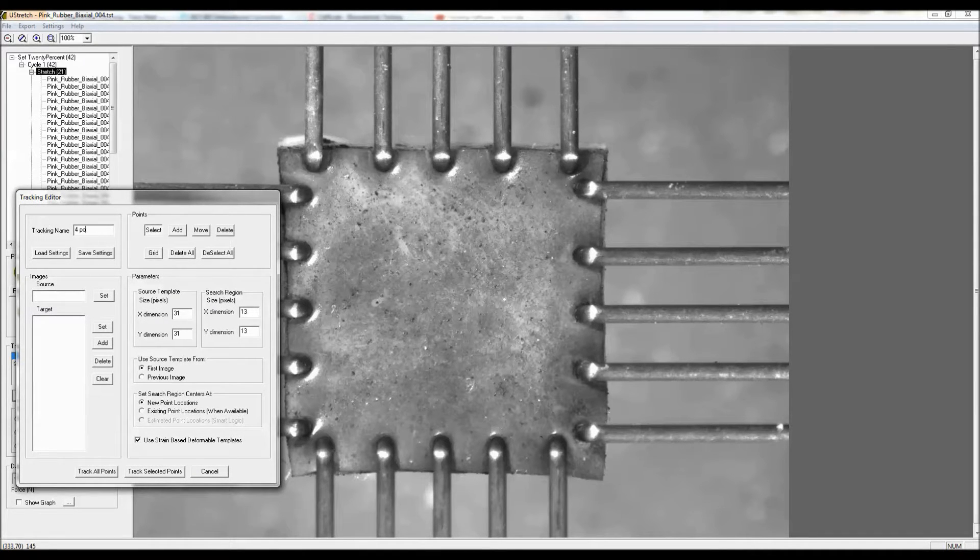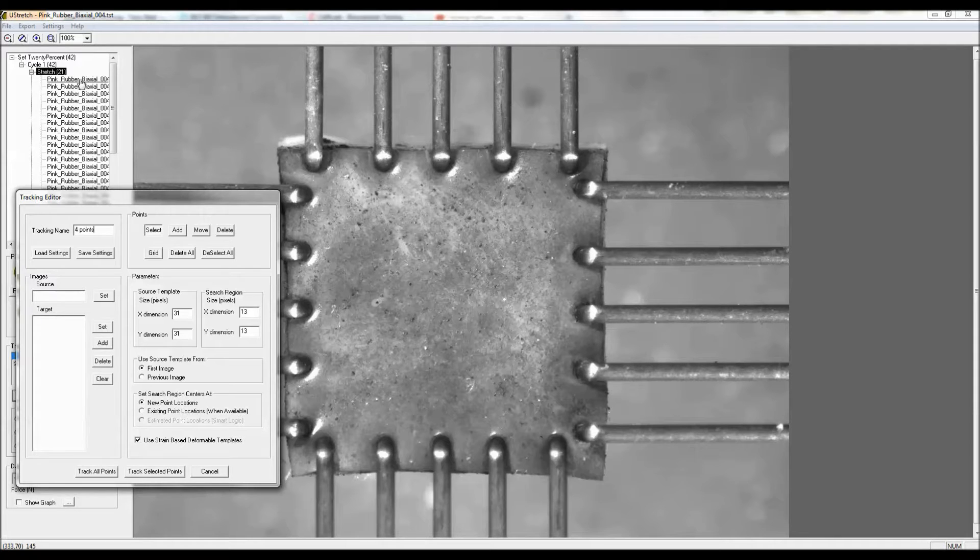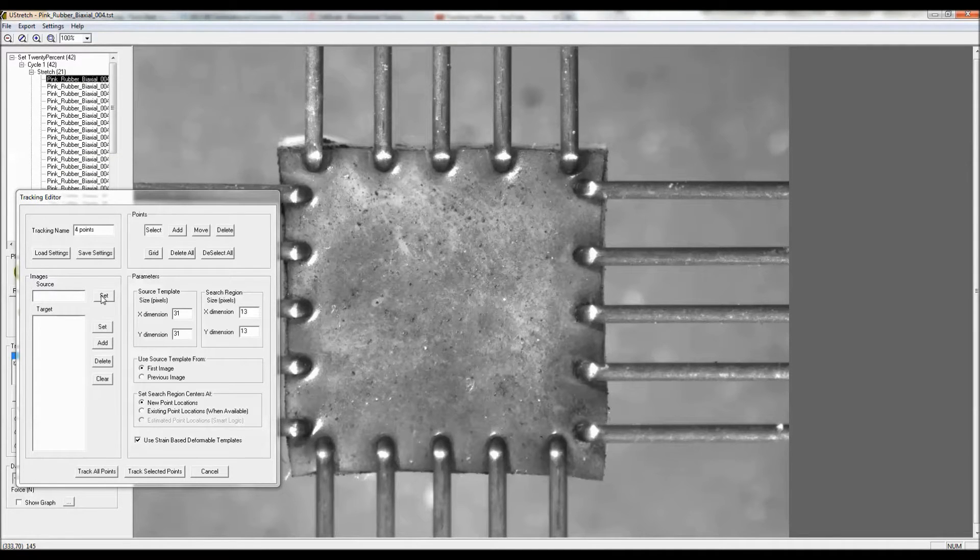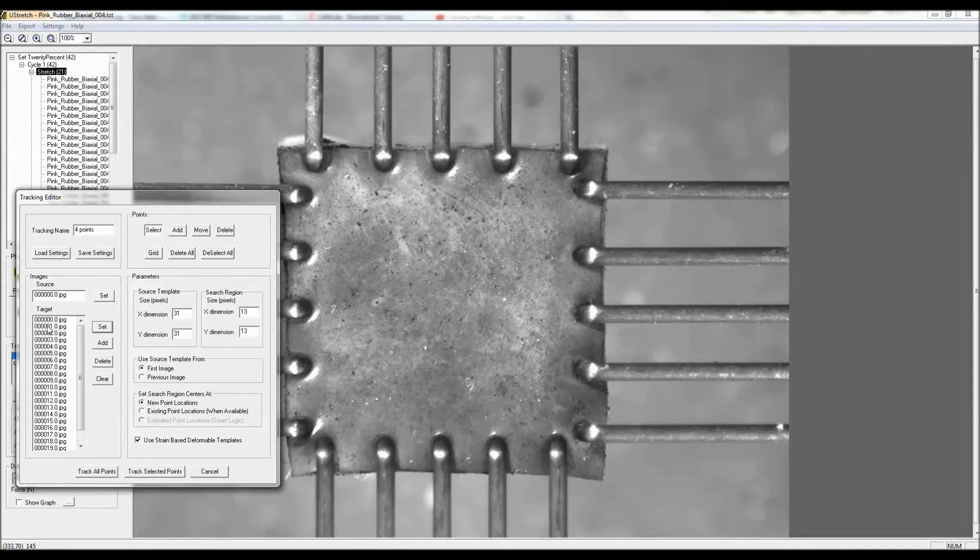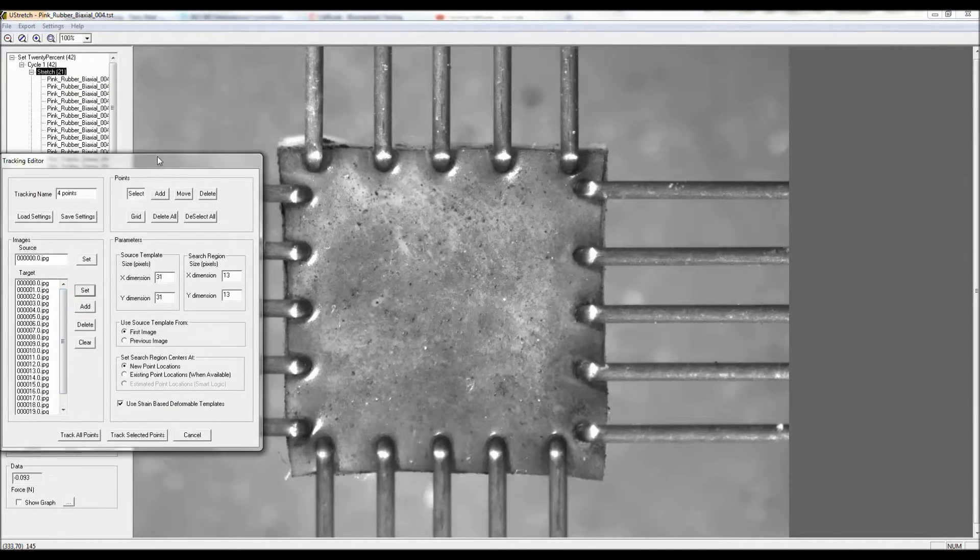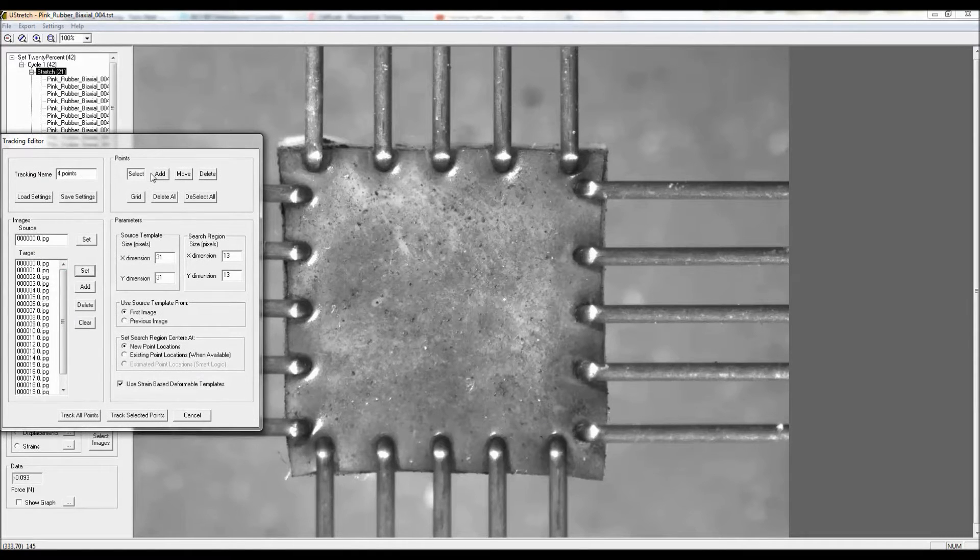So I'll call this four points, and I'm going to start at the unstretched configuration and follow some points through all of these 20 images up to 20% strain.